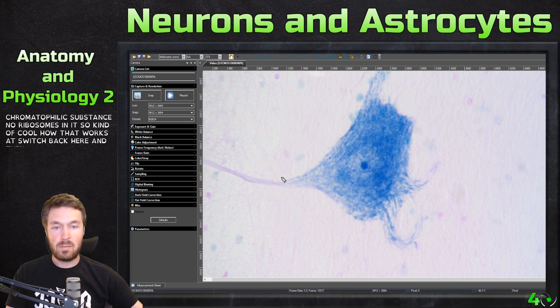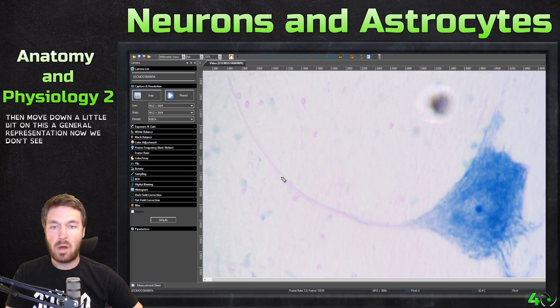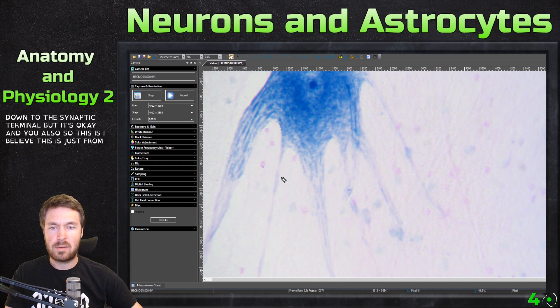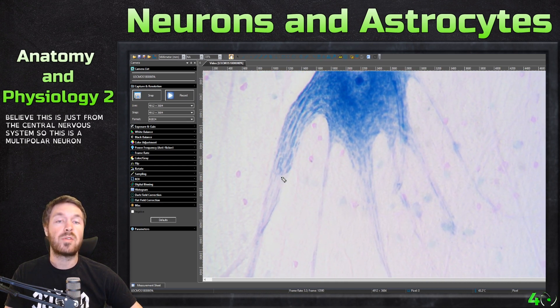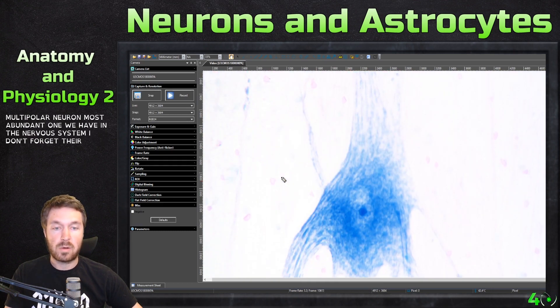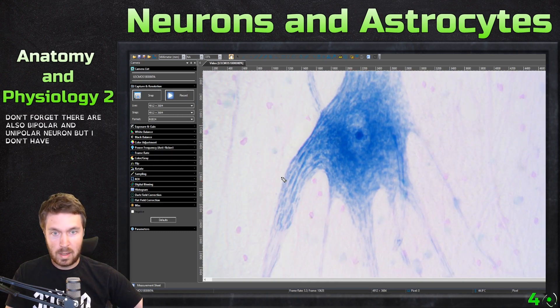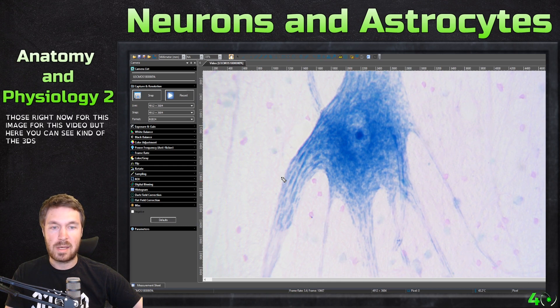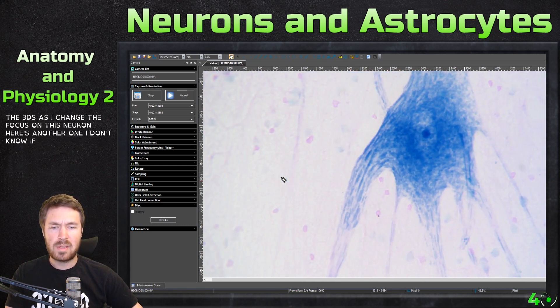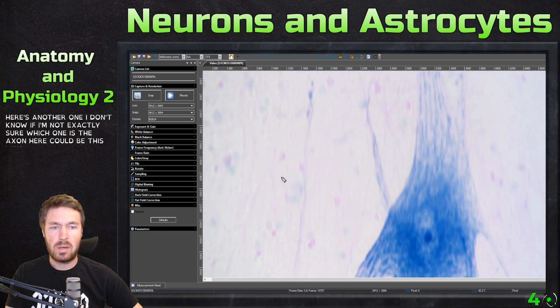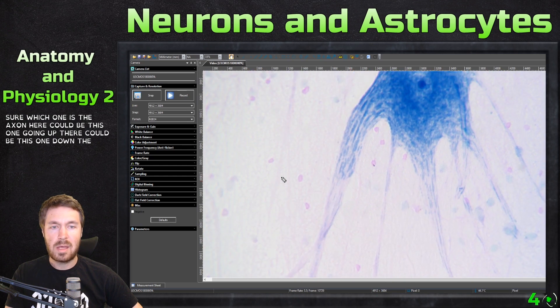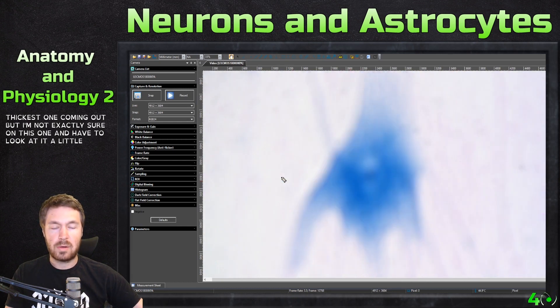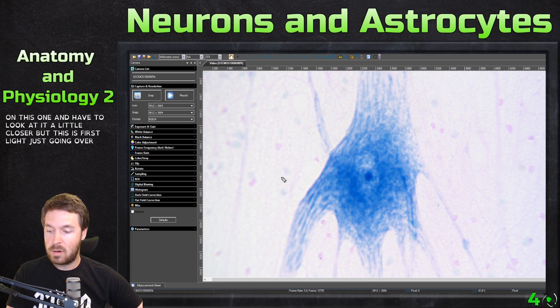So this is just a general representation. We don't see all the way down to the synaptic terminal, but that's okay. I believe this is just from the central nervous system, so this is a multipolar neuron — the most abundant one we have in the nervous system. Don't forget, there are also bipolar and unipolar neurons, but I don't have an example of those for this video. Here you can see the 3D nature as I change the focus on this neuron. I'm not exactly sure which one is the axon — it could be this one going up, or this one down. Usually the axon is the thickest one coming out. But this is the first slide, giving a general overview of a neuron.